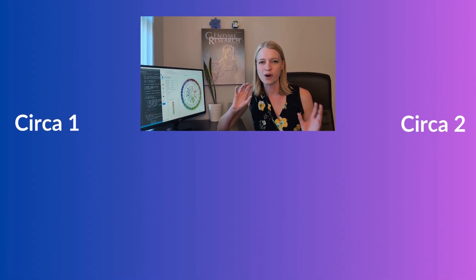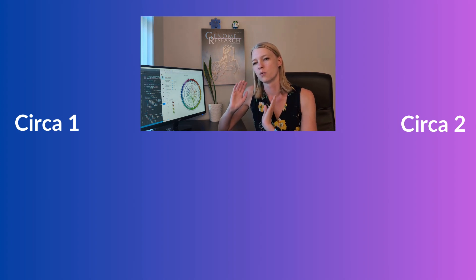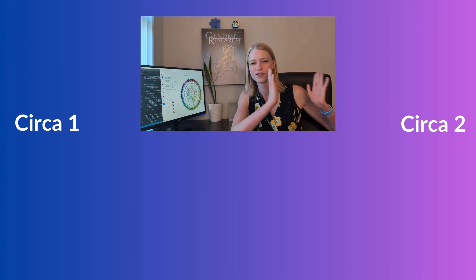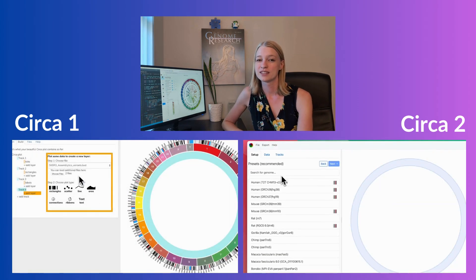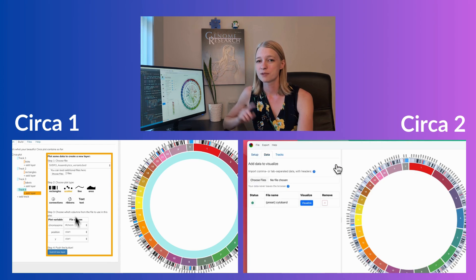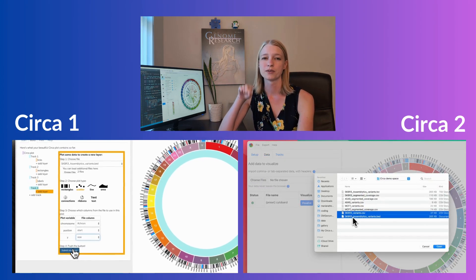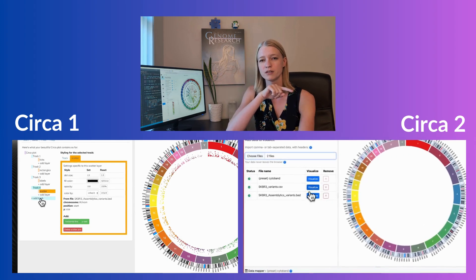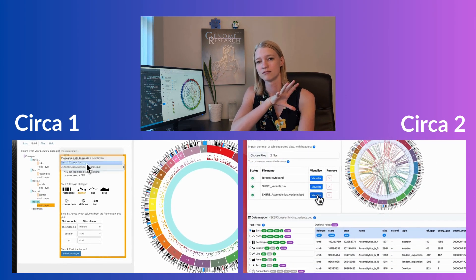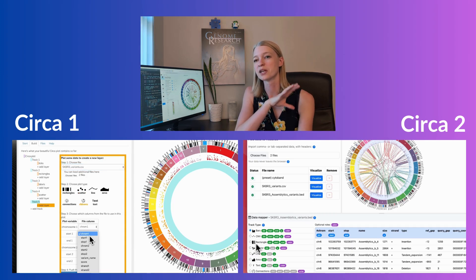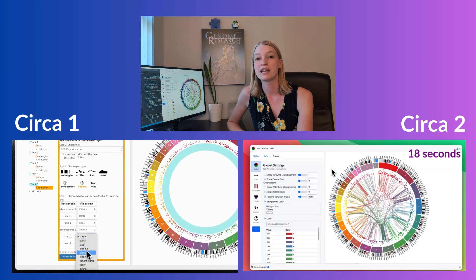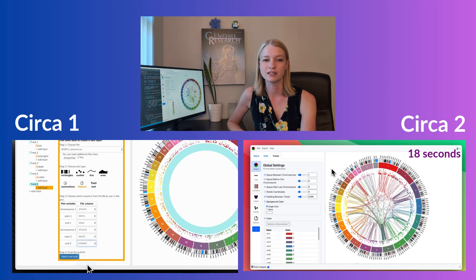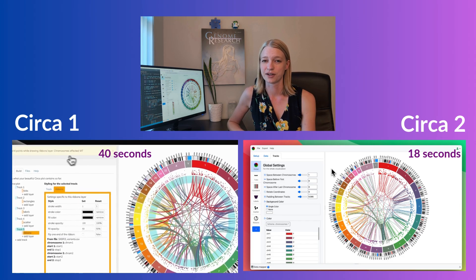Let's take a quick side-by-side look at Circa 1 versus Circa 2. In Circa 1, I'm spending a lot of time with drop-downs. In Circa 2, I push a button, and suddenly the visualization has already appeared for that file. It guesses based on the column names. We've just made everything so much easier — the user experience is super smooth and it saves you tons of time.